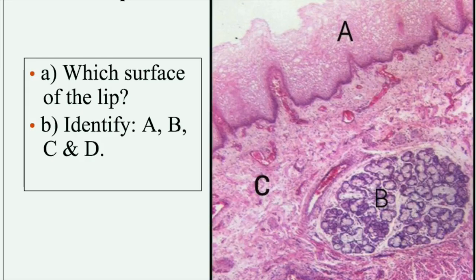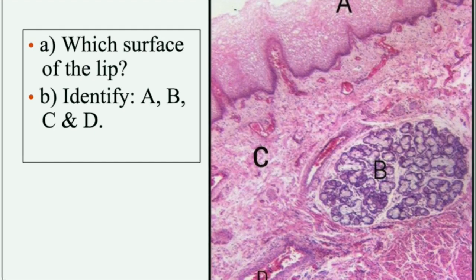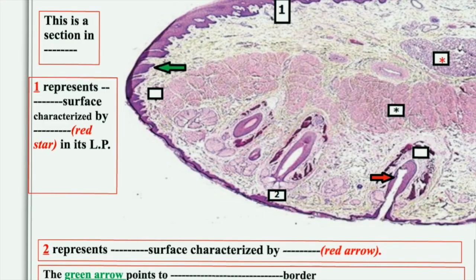Slide number four: surface A is the inner surface or mucous membrane side. Label A is the non-keratinized stratified squamous epithelium, label B is the labial glands which are mainly mucous with occasional serous acini, label C is the connective tissue corium under the epithelium containing blood vessels, nerves, and lymphatics. In identification you just mention the name. Label D is a blood vessel, visible by the blood inside.